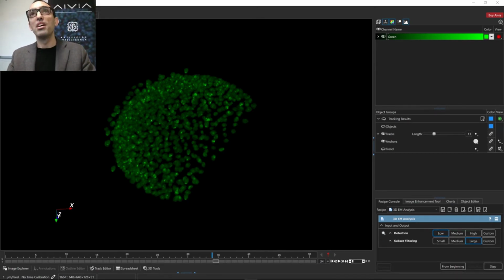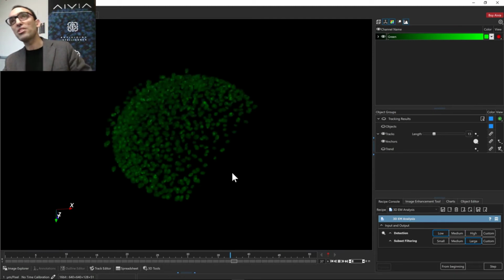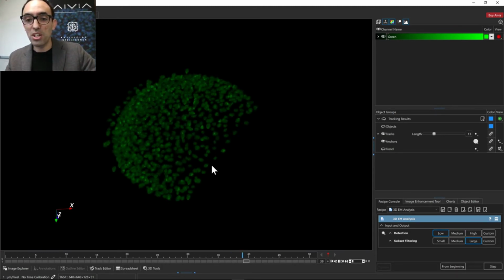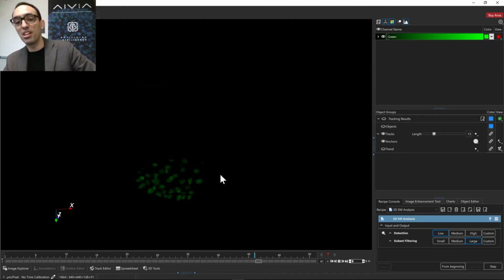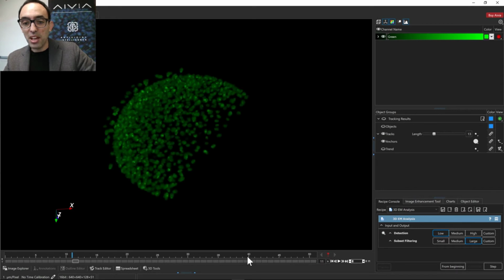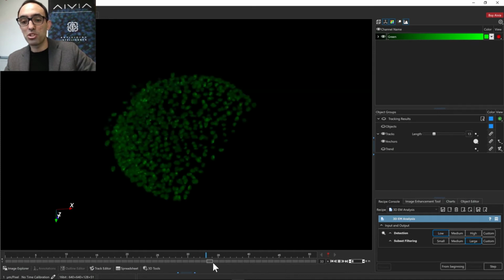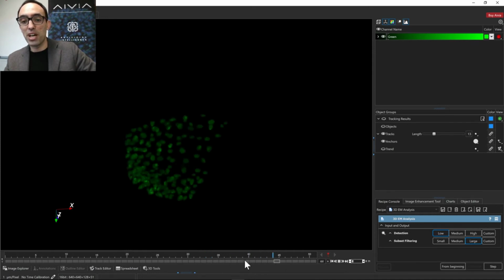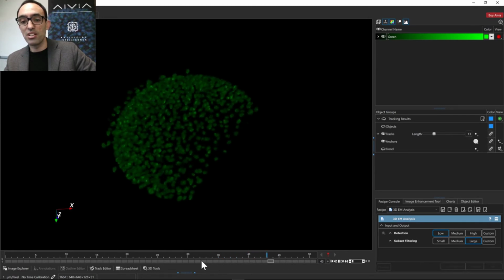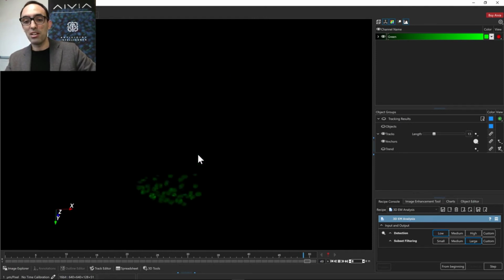Okay, so you can see me as well. So that's the original data. I'm going to play it through very briefly so you get the sense of what it looks like. This is the first time I played through this data set in volume rendering. That's why you see the blocks loading. You can, of course, go to any of the time points and instantaneously you get that, and we are buffering or caching those. So after it runs through a particular section, it's now going to fly through those time points, like this section here. And if it hasn't loaded that part, then it's going to take a few moments.